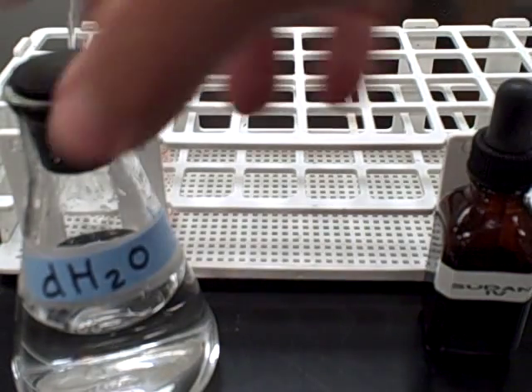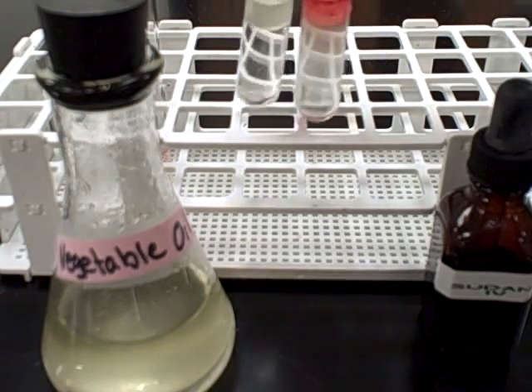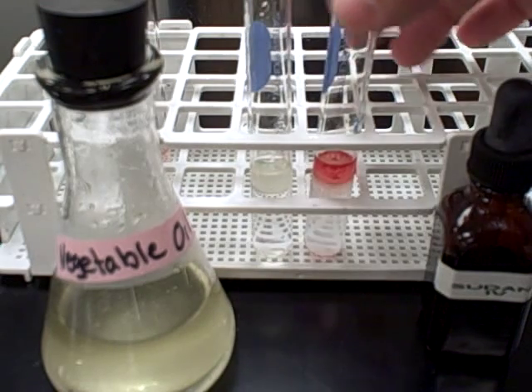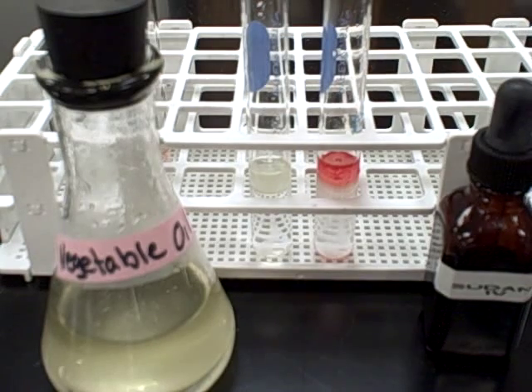Next we have vegetable oil with a little water mixed in. We have vegetable and water, and vegetable and water with Sudan 4. You can see the strong red color.